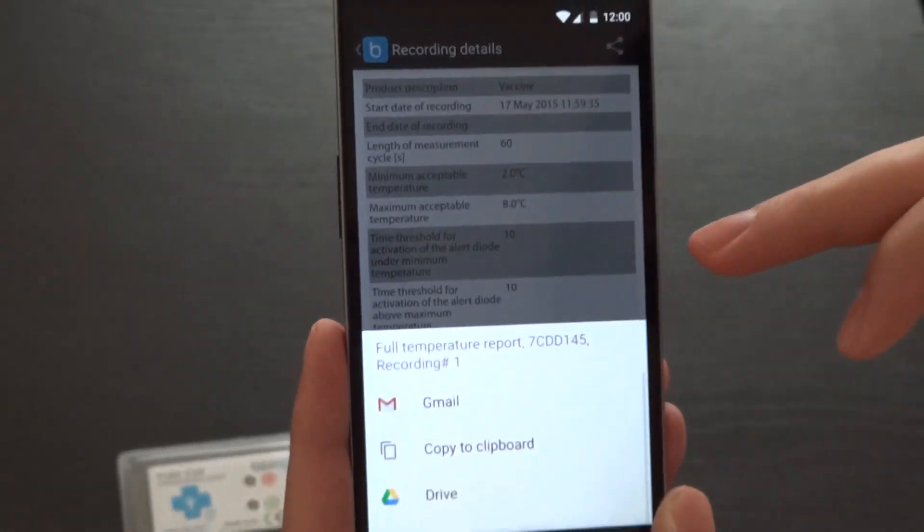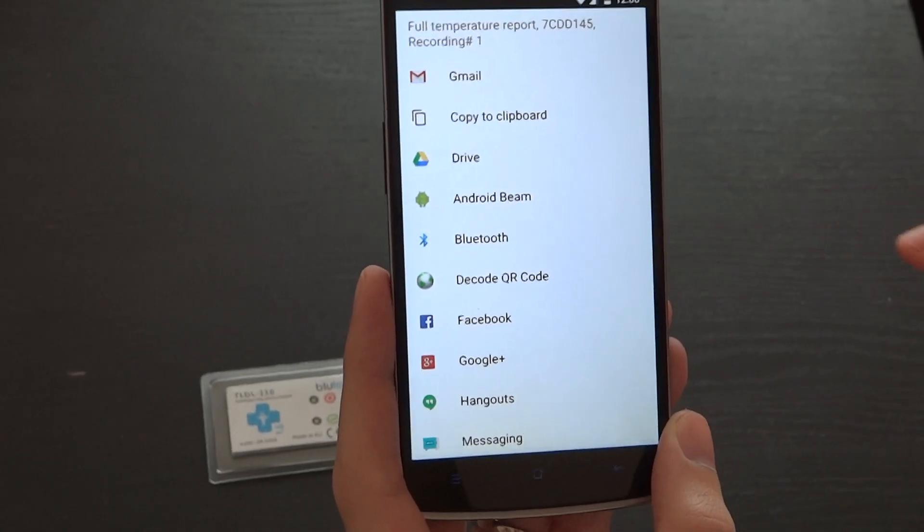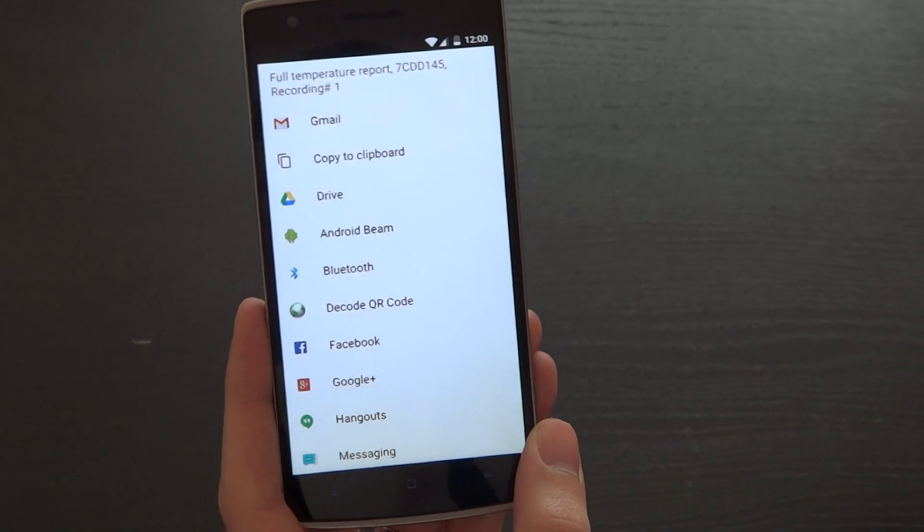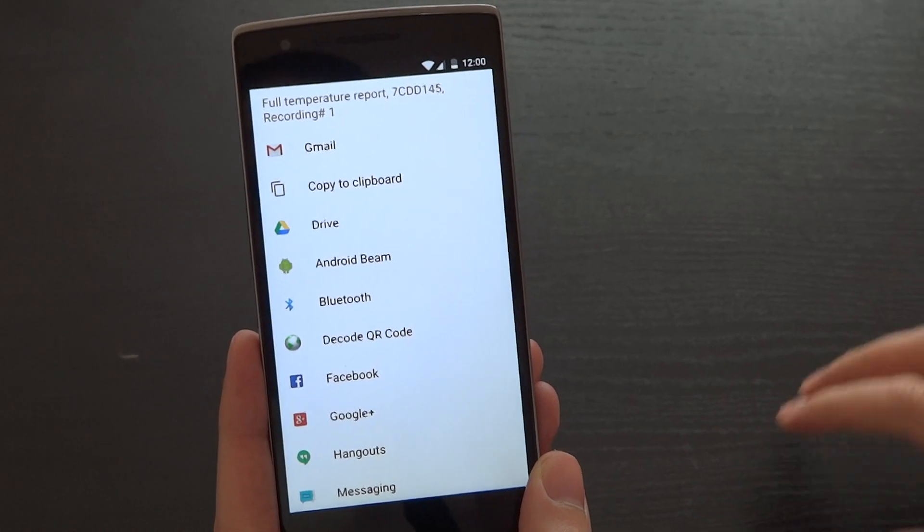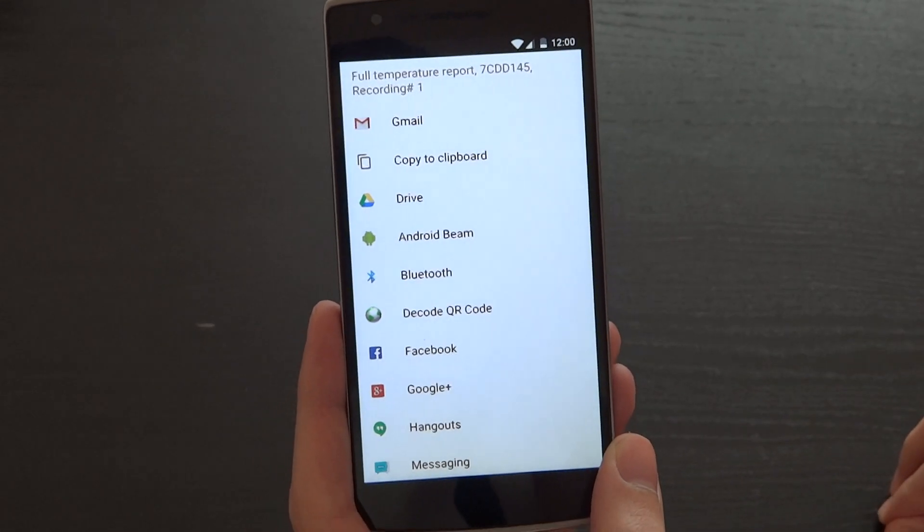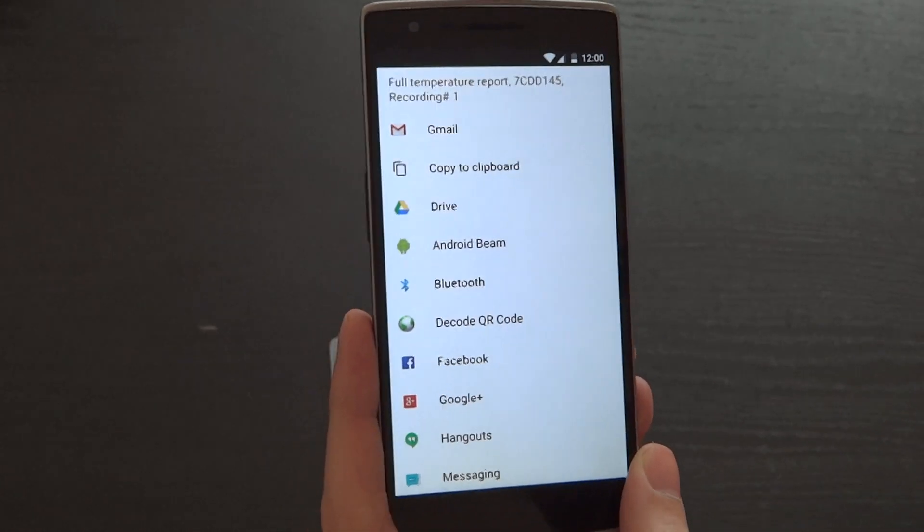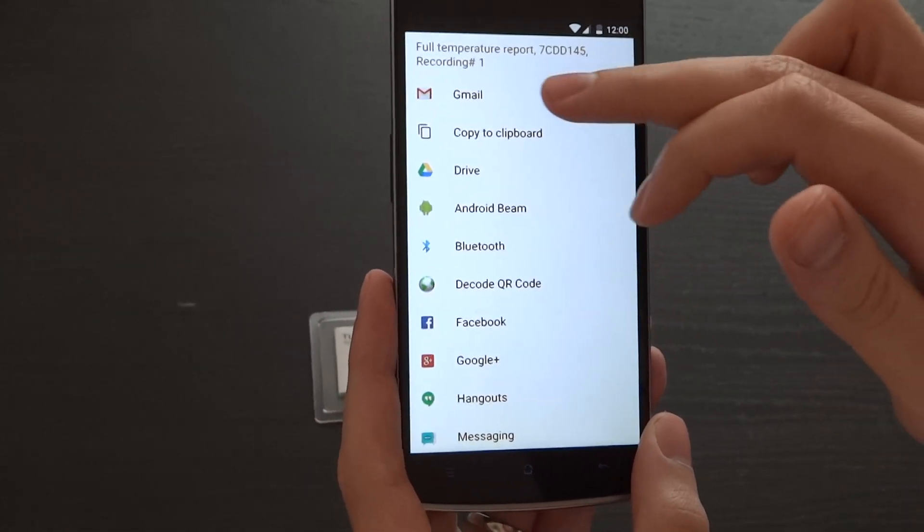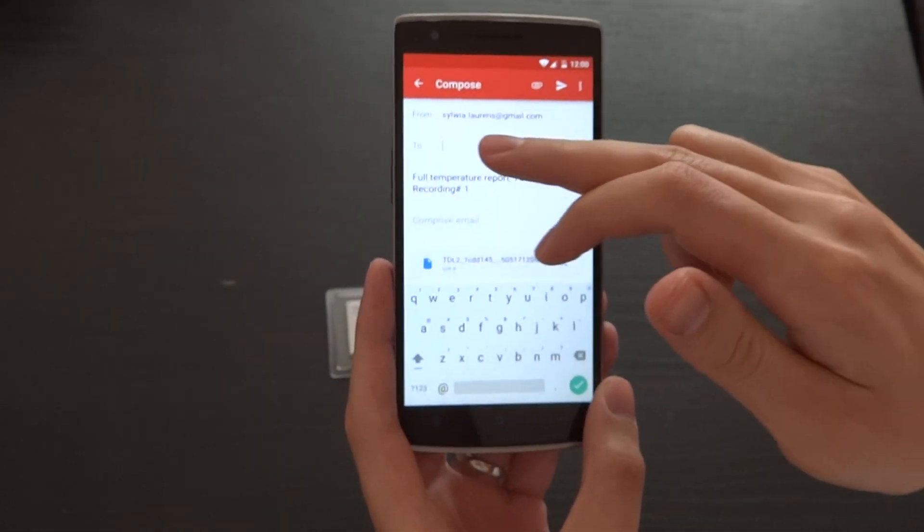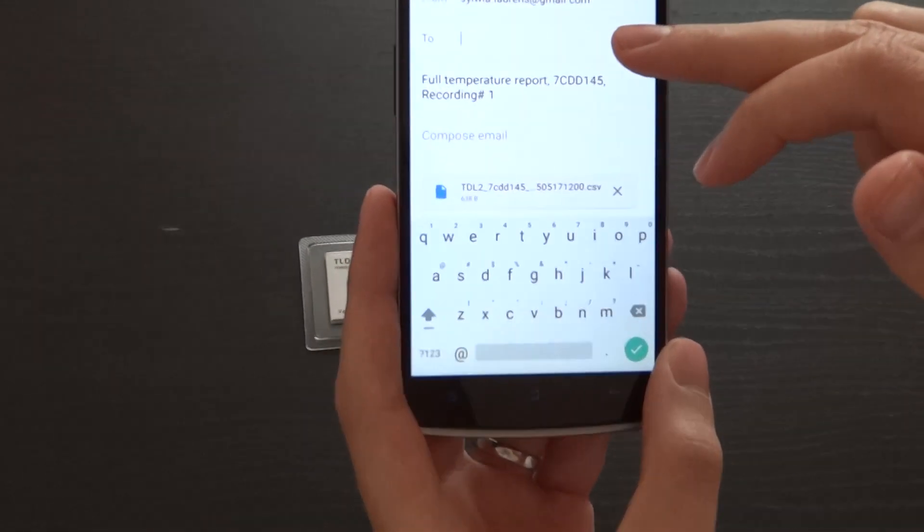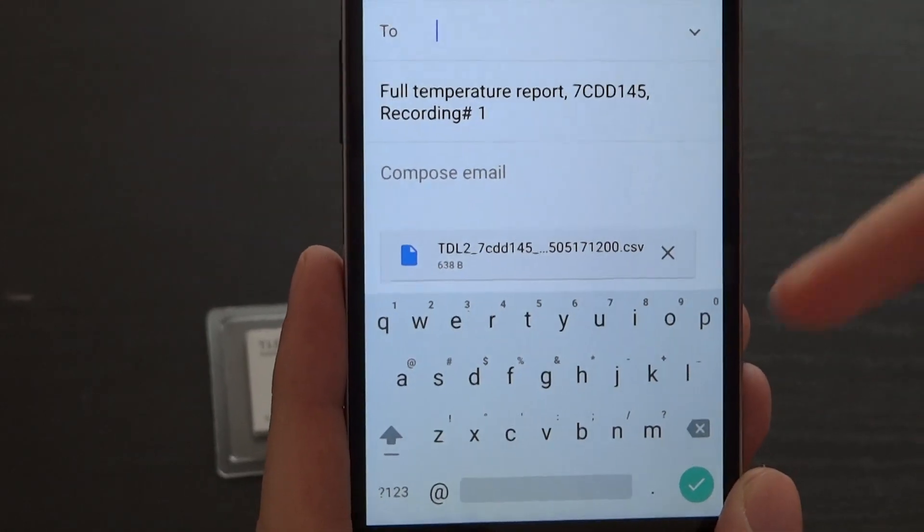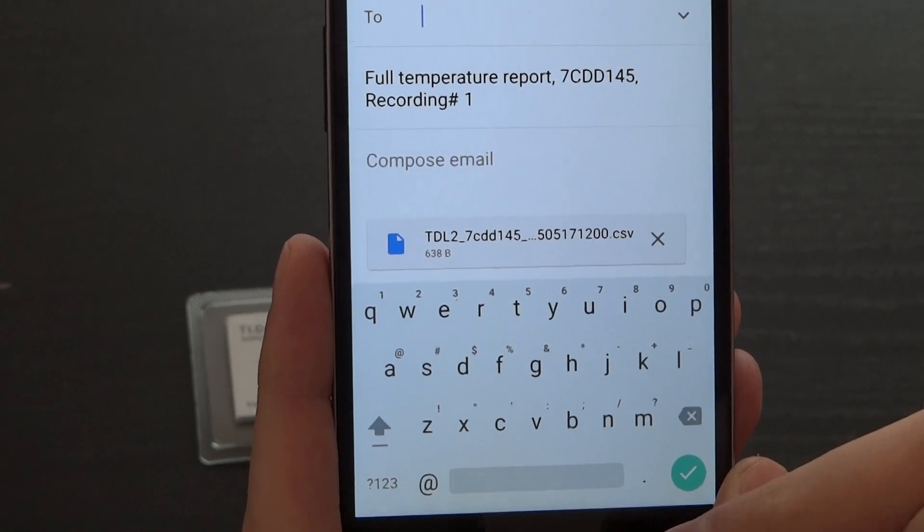You can also share the full temperature report containing information such as mean kinetic temperature, extreme temperature during the recording time, and the list of all the temperature excursions as well as the full list of temperature measurements. This temperature report can be sent via email by indicating the address of the recipient, and the email is already by default created with the title and the CSV file.